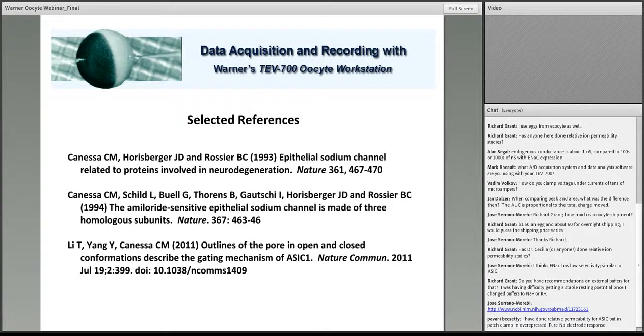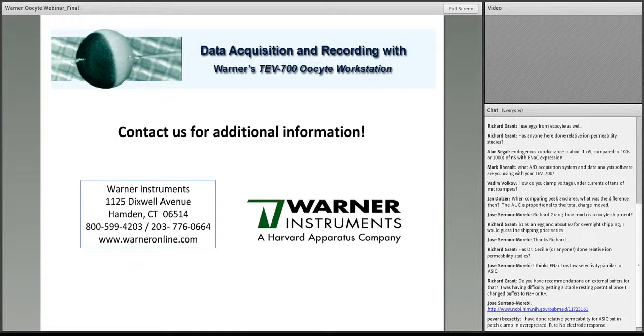If you leave it that way for days, the cell is going to swell and become in really bad shape. So what we used to do is to add amiloride, a blocker, to the bath to prevent toxicity. And by that simple maneuver, the oocytes can last 2 to 3 days. Not too much longer, especially if there's very good expression. Very good. So are there any more questions from the group for today's speaker?